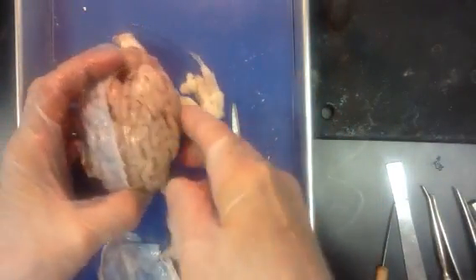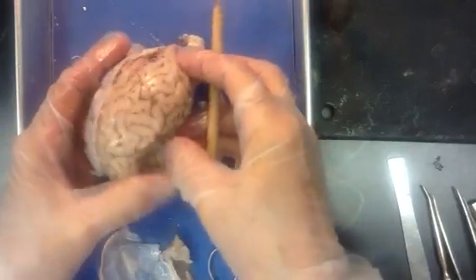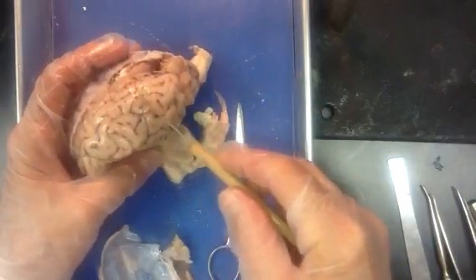Now we want to see the pia mater, and then we'll come back and look at the underside — the inferior side of the brain. Pia stands for tender. This is the tender mother.